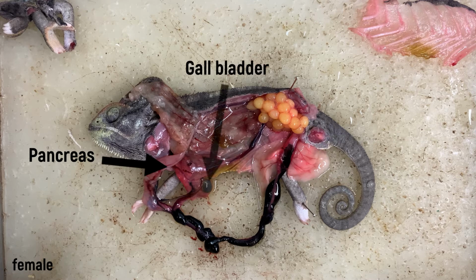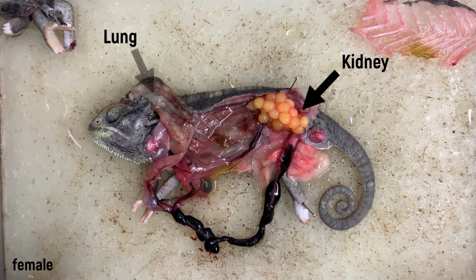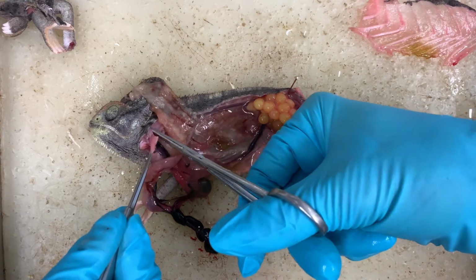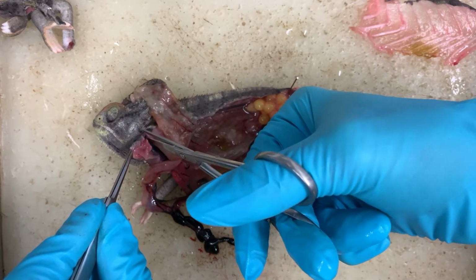The gallbladder is relatively large and is closely connected to the liver. The kidney sits dorsal to the ovaries. To examine the heart, we extend our incisions slightly forward. We can then excise it to look at it in more detail.